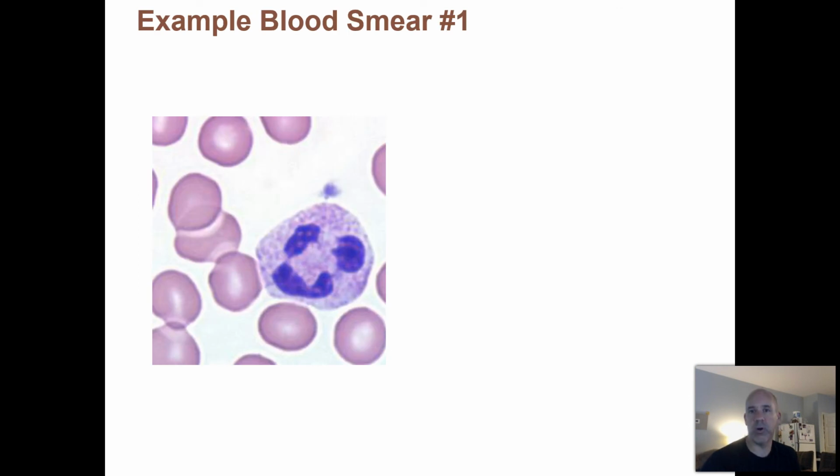All right, so on your chapter 17 test, I will have a few questions where I'm going to ask you to recognize the different types of blood cells from a blood smear. And no, they won't be overly tricky. I just want you, again, to get a feel for these different types of blood cells and the different appearances that they have, because I think that can help you relate to their functions. And I'll have some more practice examples for you on Blackboard before you actually take an exam.